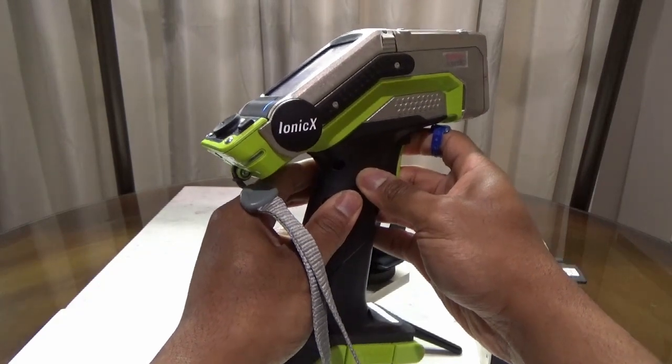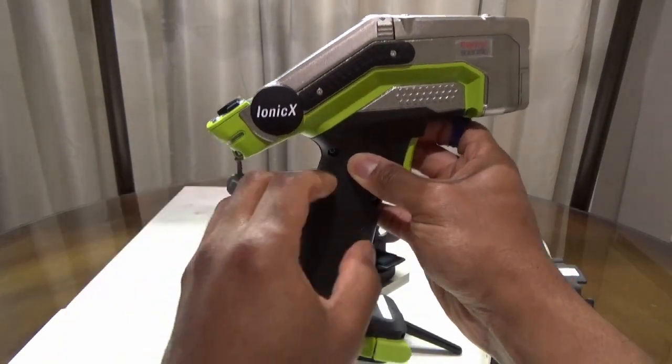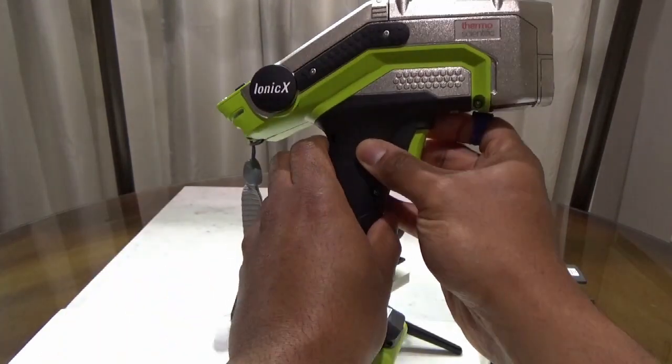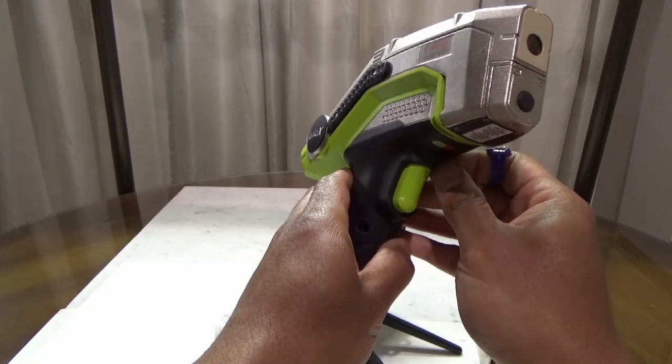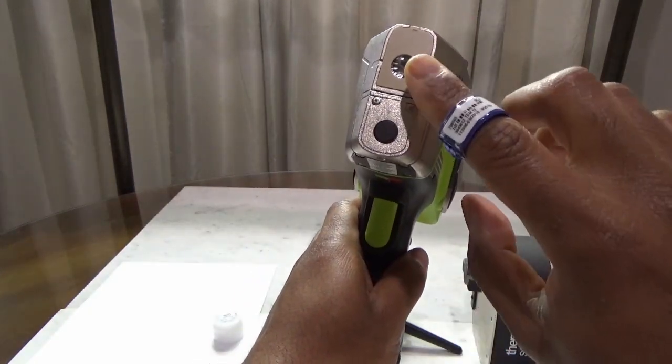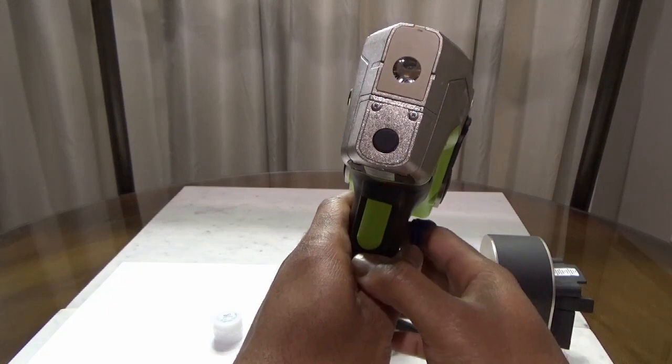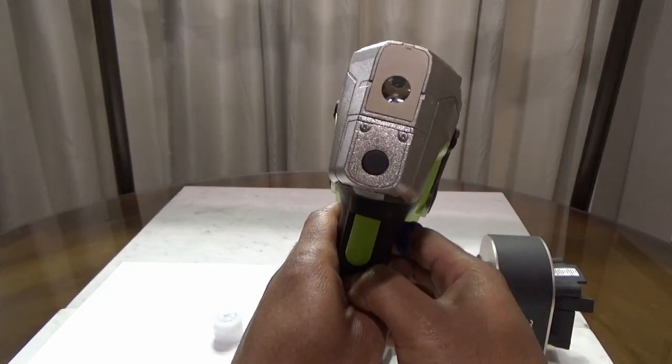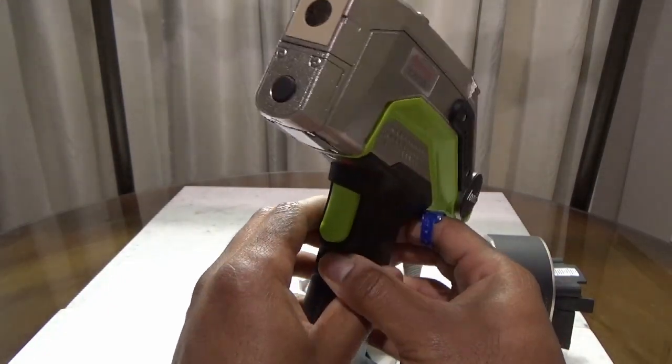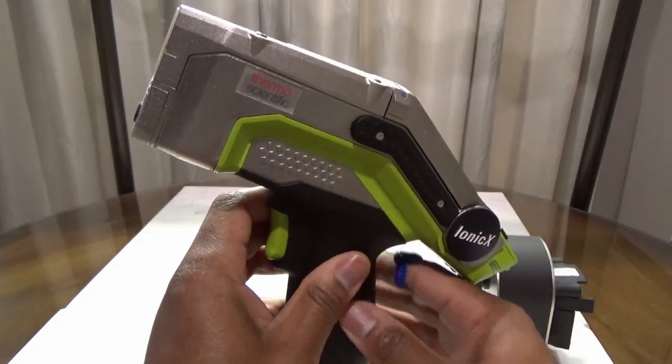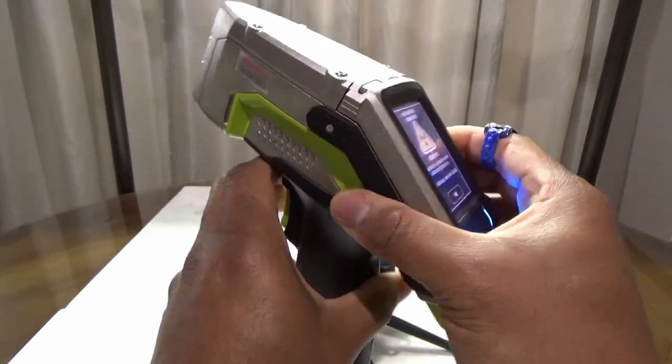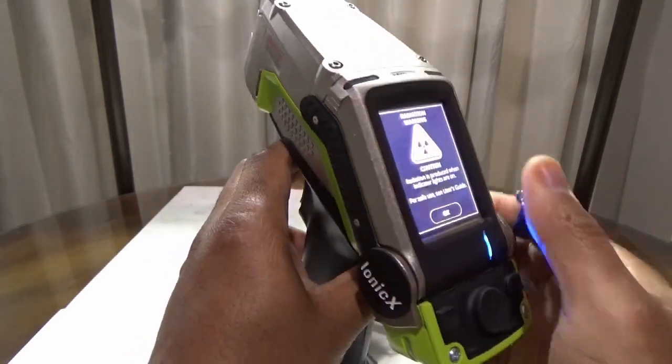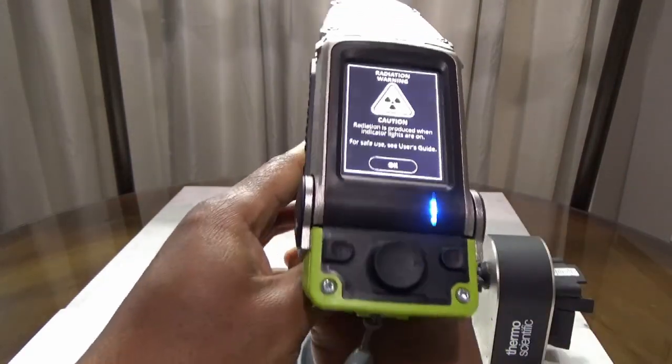IONIC-X can also identify basic compounds like sodium hydroxide. The IONIC-X uses an X-ray tube to emit a primary beam of X-rays from the front of the instrument into the sample to generate a fluorescent spectra for specific ionic salt materials, and our proprietary correlation value peak matching algorithm determines spectral matching to positively identify a given material.